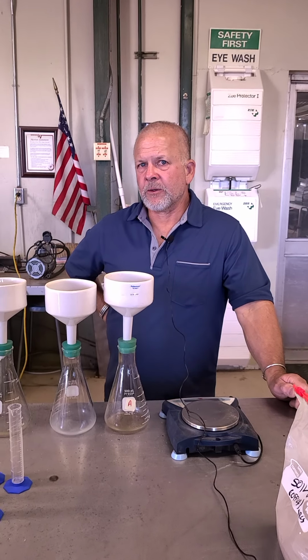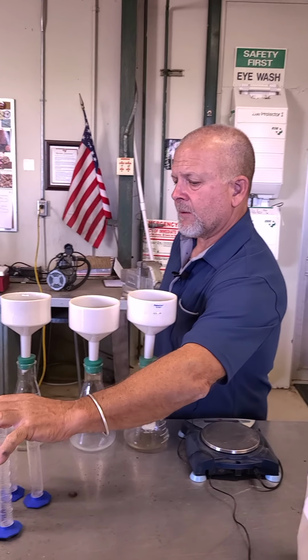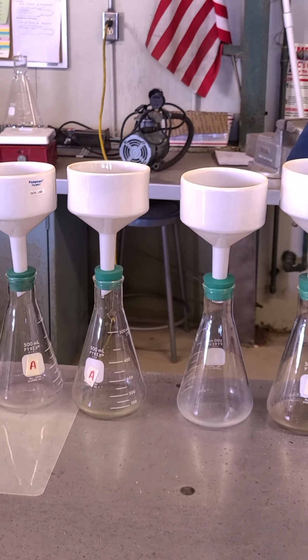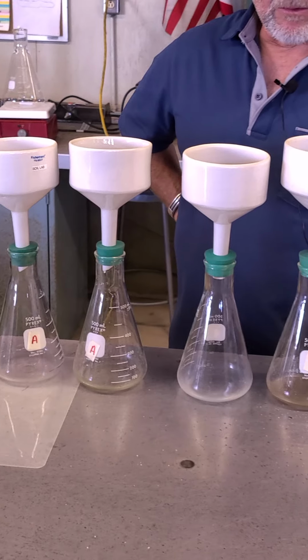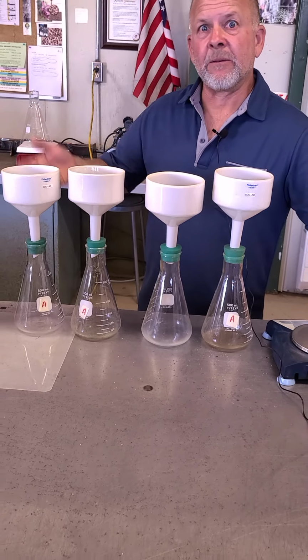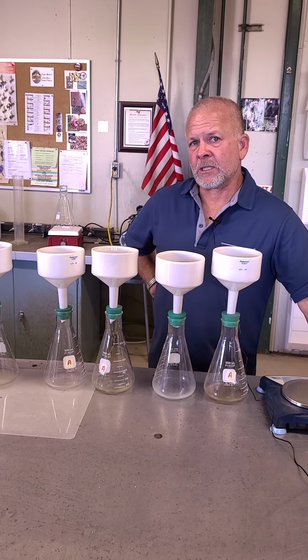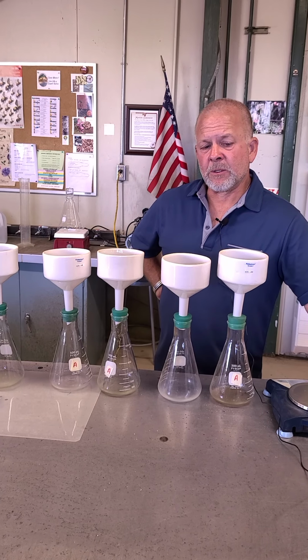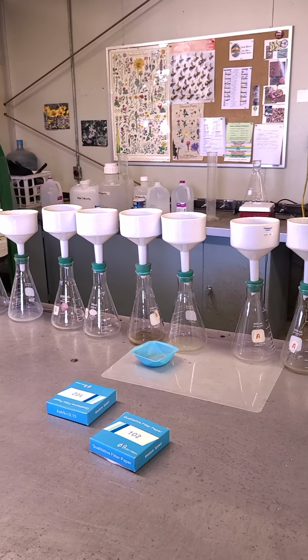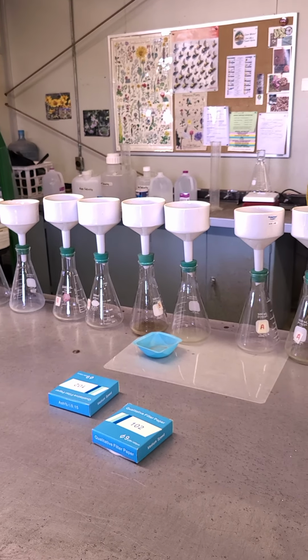Okay, so we've added all of our treatments here, and you can see that if I move these, some of them are already dripping through, and that's okay. We haven't actually started the second part of the meat of the experiment, if you will. But it's okay if these things drip through, because we're still trying to just prepare the soil. So these treatments are actually working their way through the soil, and the soil sample is going to be affected by the treatment.